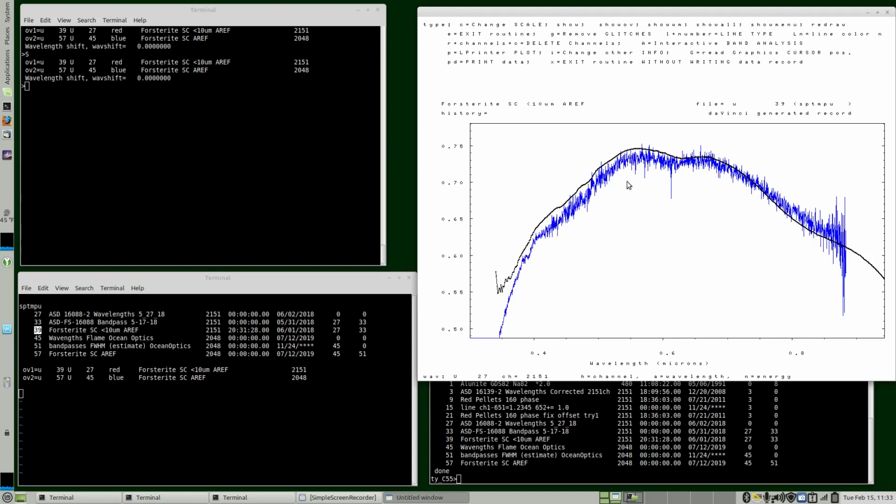If we did the same test with a hematite spectrum, which is high red reflectance and low UV reflectance, that combined with the tungsten lamp black body means signal is very low over here, and a tiny amount of scattered light will change it, and we'll see the spectra diverge more into the UV, including full upturns, much more so than just a couple of channels here. But this spectrum looks good.